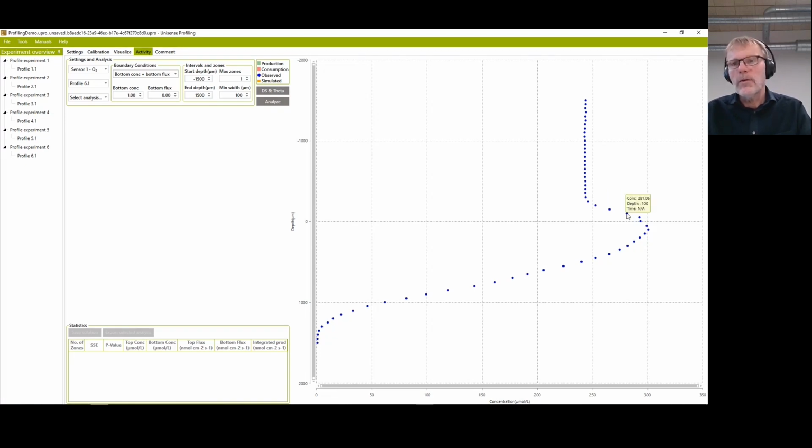So let's say at minus 100, so 100 micrometer higher up than what was set as 0 here. So I would set this at minus 100. The depth to stop the analysis must be either this point at 1500 or maybe that one here, which if it's already 0 here, it probably is. So I'll set it at 1450. We can always change this and see how it affects us later.